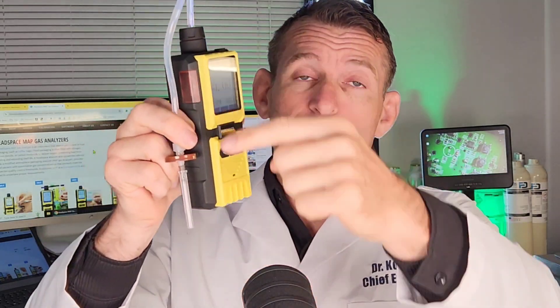This is becoming an industry standard — we are selling many, many of these headspace analyzers. And why? Because they are easy to use. No complicated training required for your staff or employees. It's one-button operation. It comes with a large display and a built-in pump so the air is drawn through the needle, through the filter, and into the unit. Pretty simple.